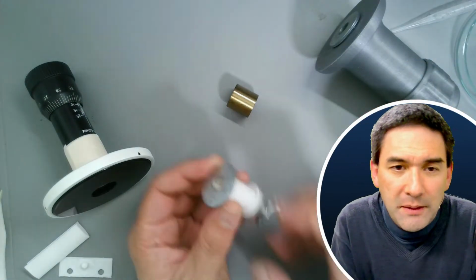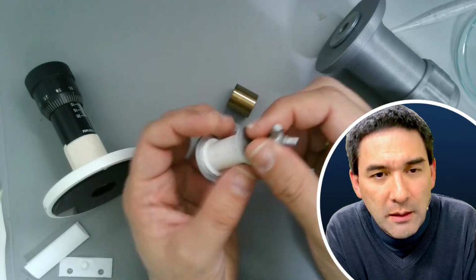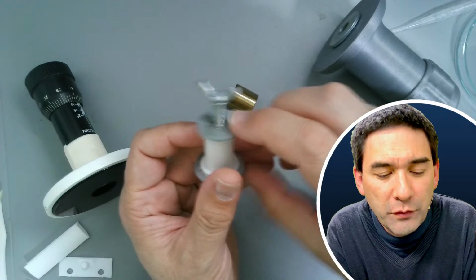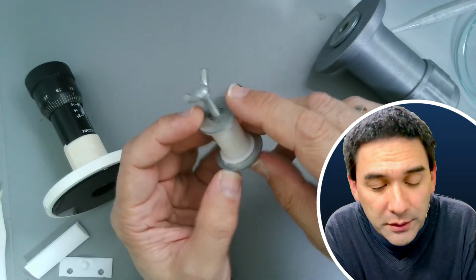And this here is a homemade version. You see that essentially I put a little screw in here. There's a little nut and a bolt, some washers to make it more stable. I used hot glue, a glue gun, to glue it on.